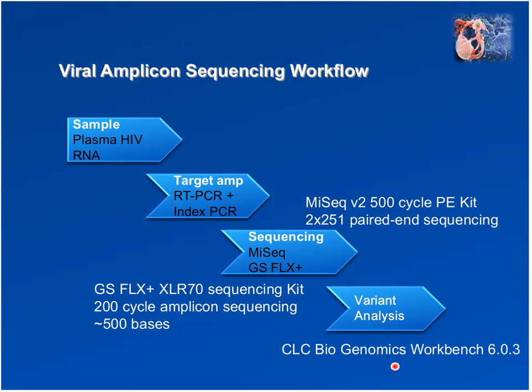So here I described the workflow, and I do realize that I glossed over a lot of the detail involved here. Of course, the proficiency that you employ at this stage of the game, particularly the first 2 steps, how accurately you can generate your amplicons and how free they are of any non-specific products, will then result in a very clean next-generation sequencing result.